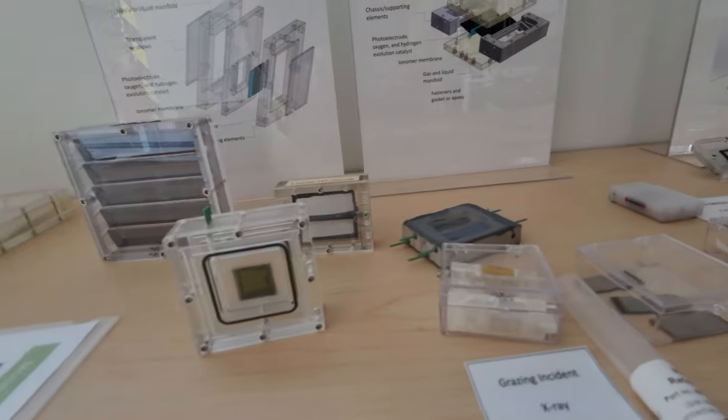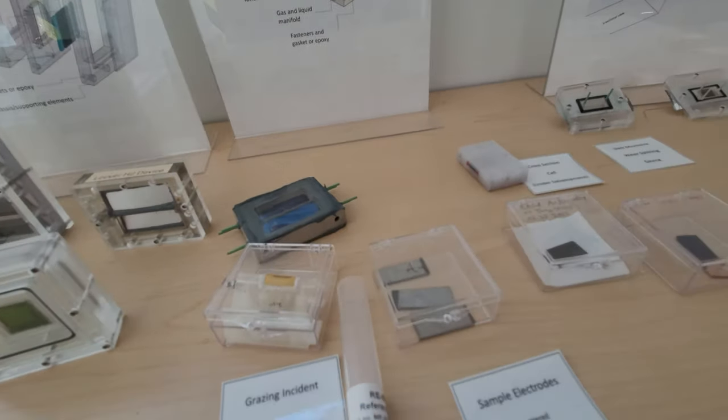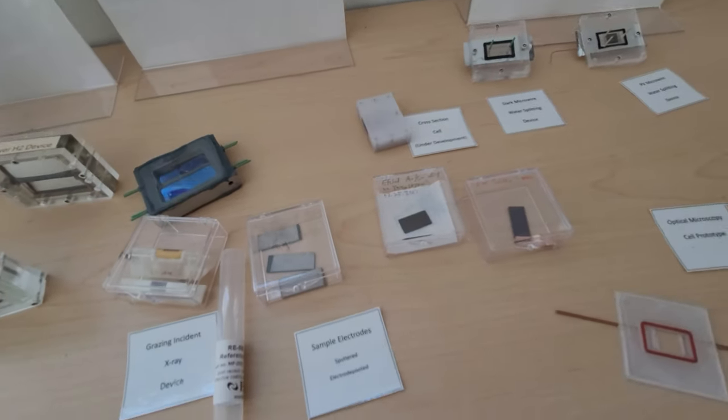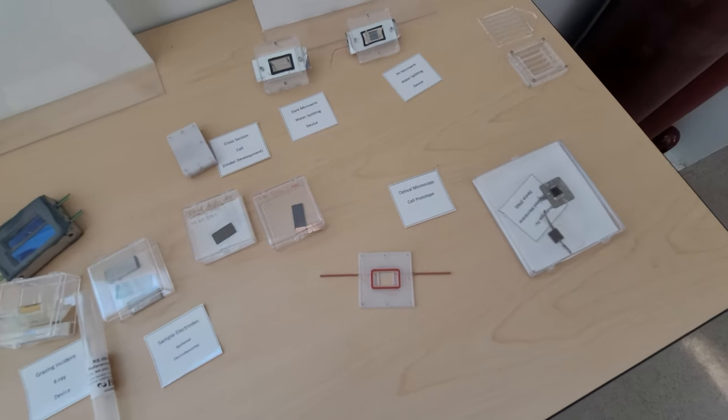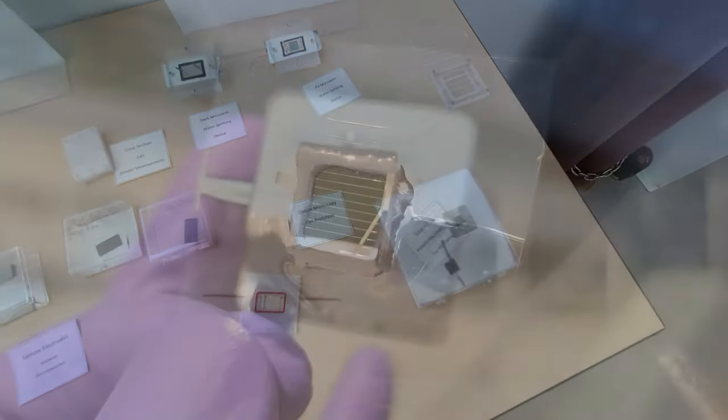Chassis are being developed around designs which use fully aqueous environments, fully gas-fed architectures, or a mixture of both aqueous and gas-fed. This brings us back to the hydrogen-evolving device we saw at the beginning.